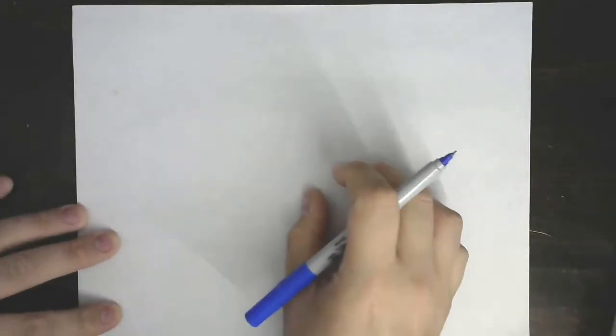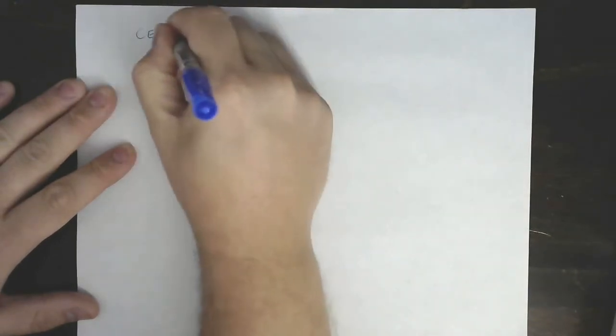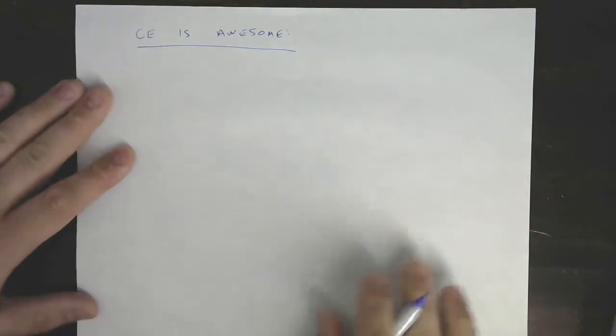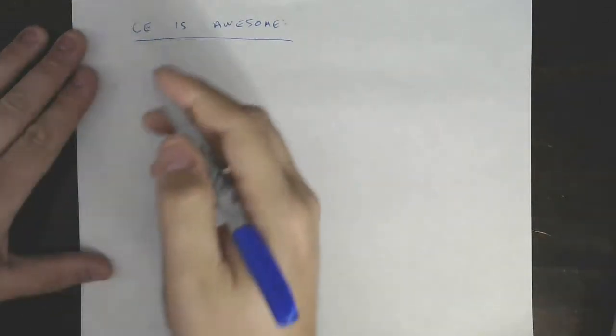Full disclosure, I'm going to be extremely biased here because I spent most of my career working in CE. But I'm going to make a bold statement, and that bold statement is CE is awesome. I'm not going to go quite as far as to say it's the number one best separation technique for everything. In fact, it's not, but it has some really amazing properties that we don't find in most chromatography methods that, for me, have been intriguing for my entire career. So let's point some of those out.